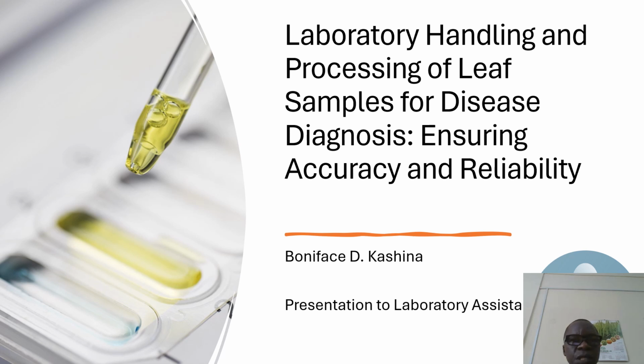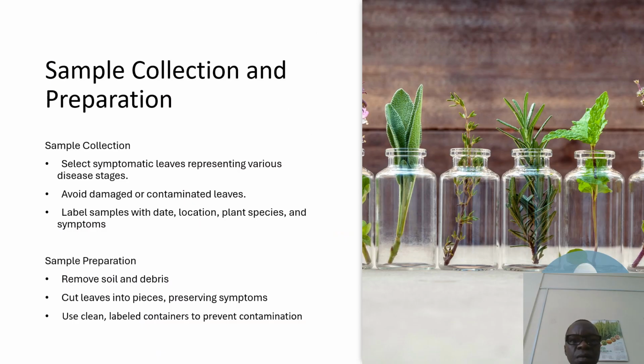I welcome you to this presentation on the laboratory handling and processing of leaf samples for disease diagnosis. We are actually aiming at ensuring accuracy and reliability in our tests. First, you need to collect samples and then you need to prepare them.